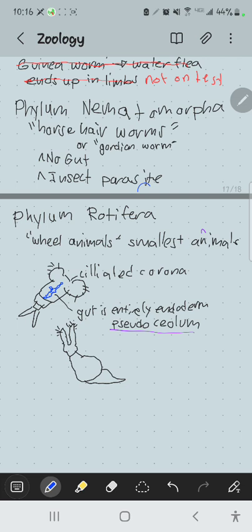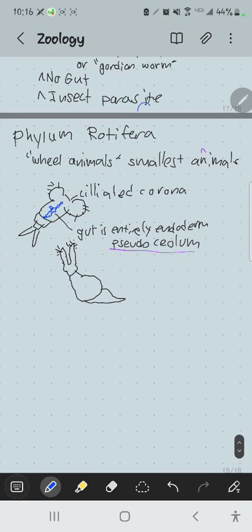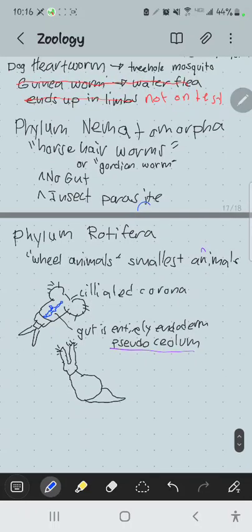I have Trichinella, so make sure that you look at those because I'll have those on there. You have to know that's the Trichinella parasite that causes the muscle infection. Then I have these Nematomorpha, horsehair worms, and Gordian worms, and then I have a slide of rotifers. So that's not too much to look at today. Good stuff. Okay, there you go. Have at it. I think all the specimens are out. There's only a few slides to look at.